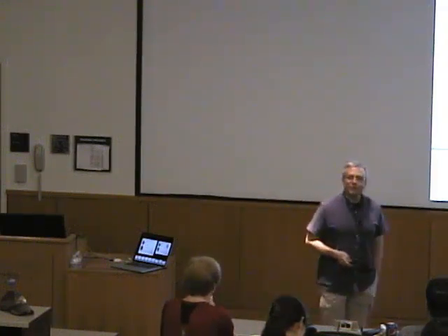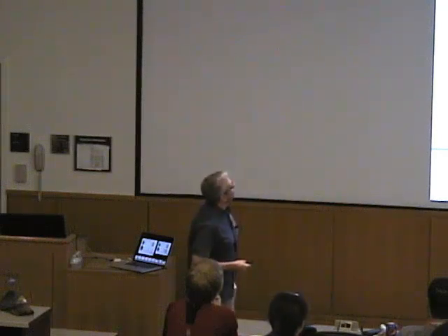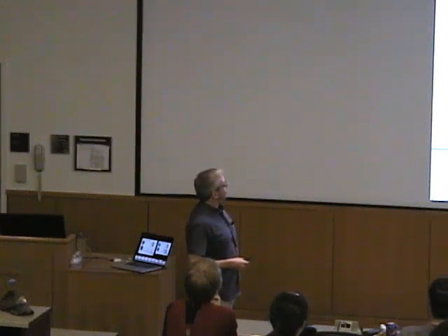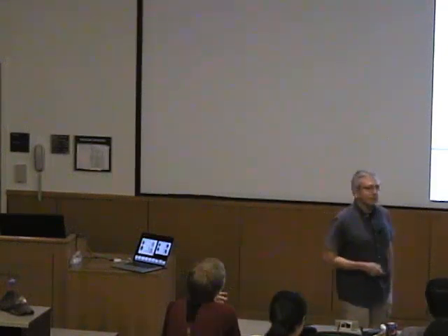Okay. And then, of course, you can start messing around with them. That's great. And you can, for example, take the amplitudes of Jerome Karle and the phases of Herbert Hauptman, and vice versa. And then you can back transform this, and you can see what happens. And you would probably guess that you end up with pretty much of a mess, right? That's what you would expect, because, I mean, after all, they are not that homologous. Okay? What you get is this.